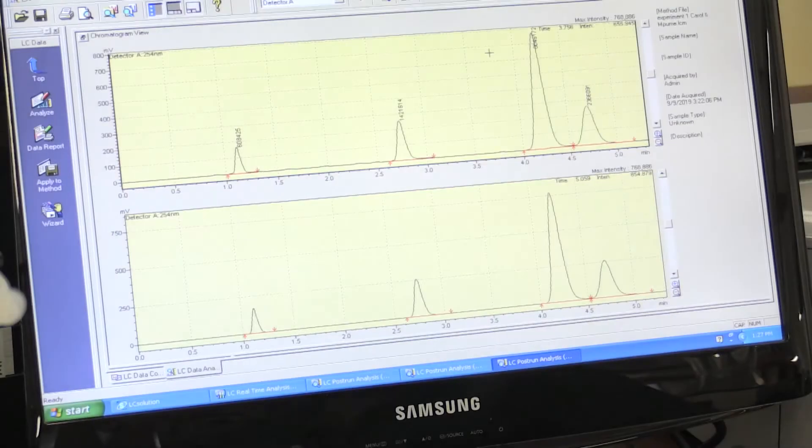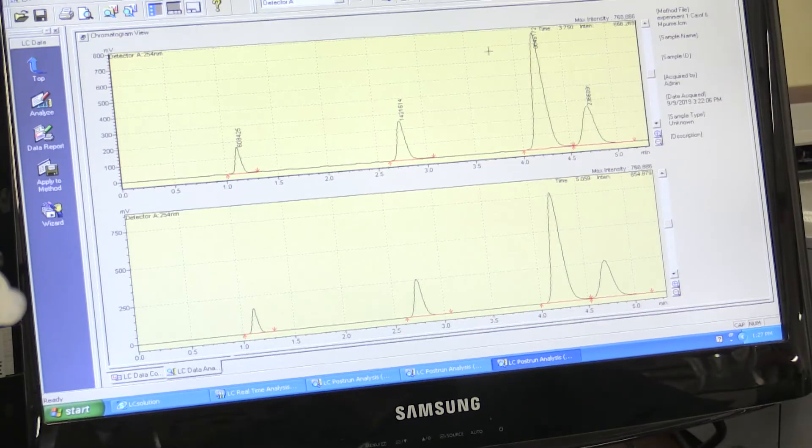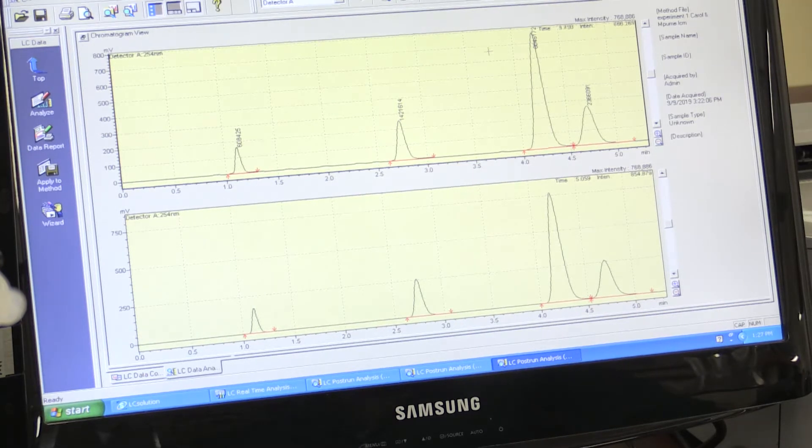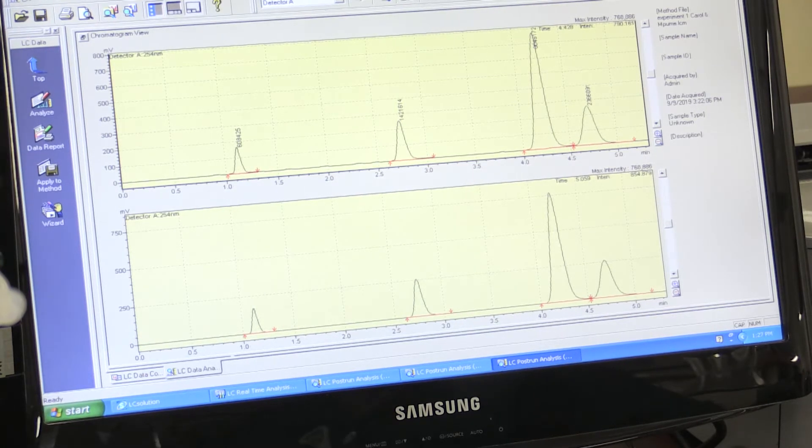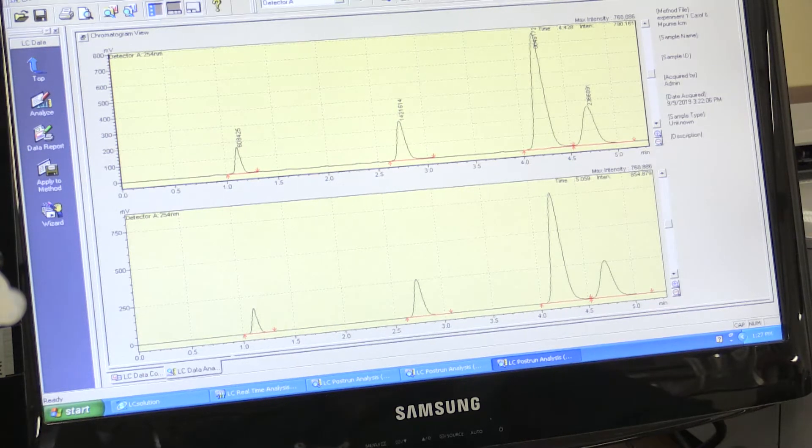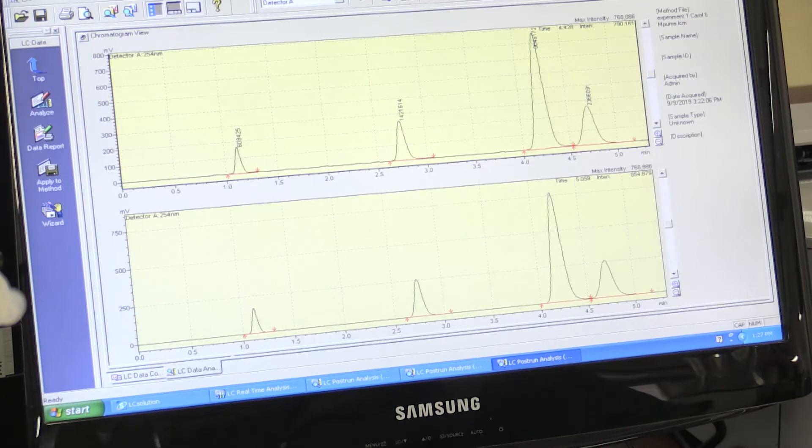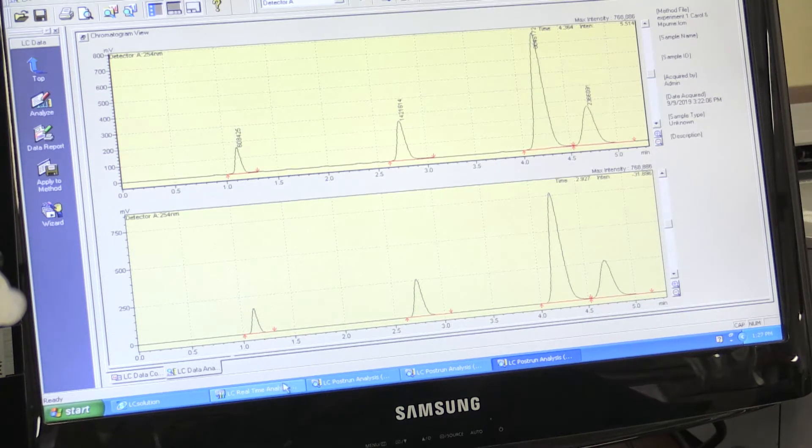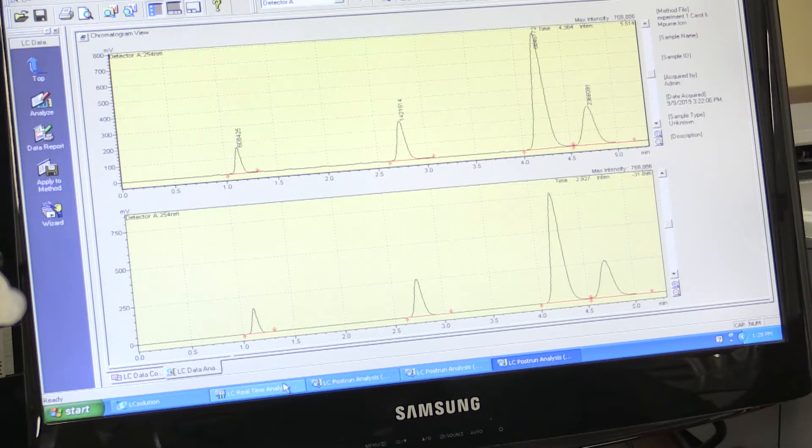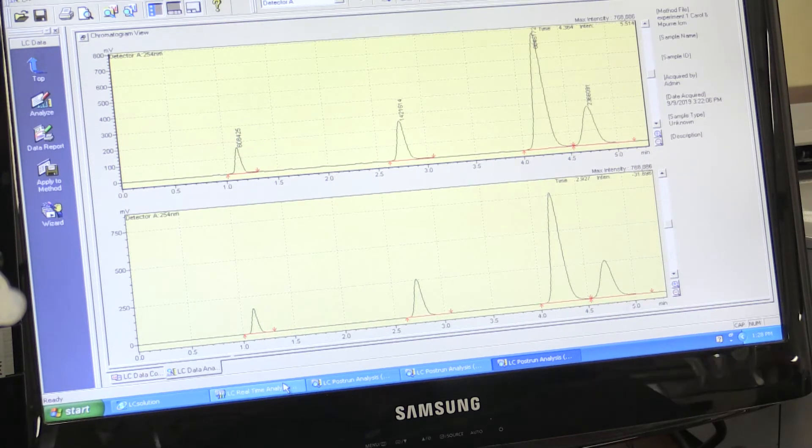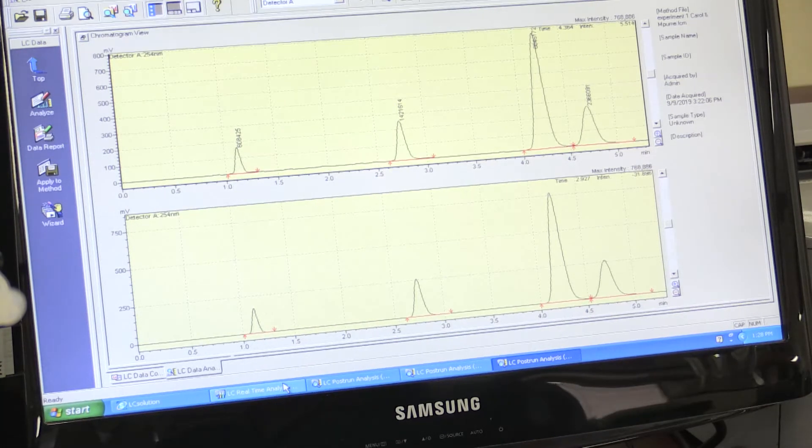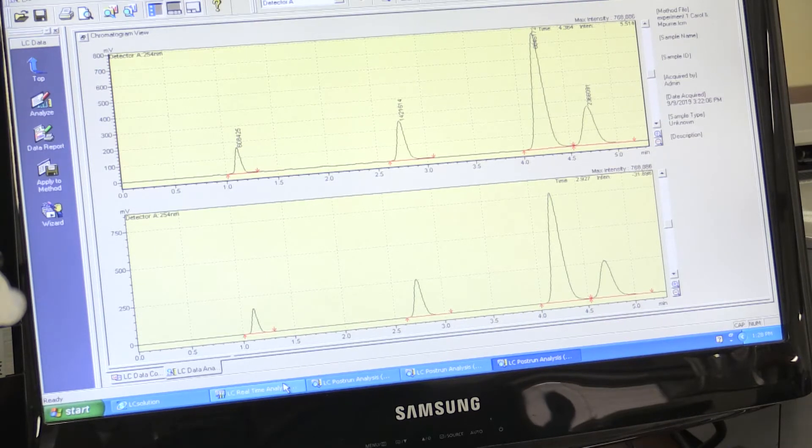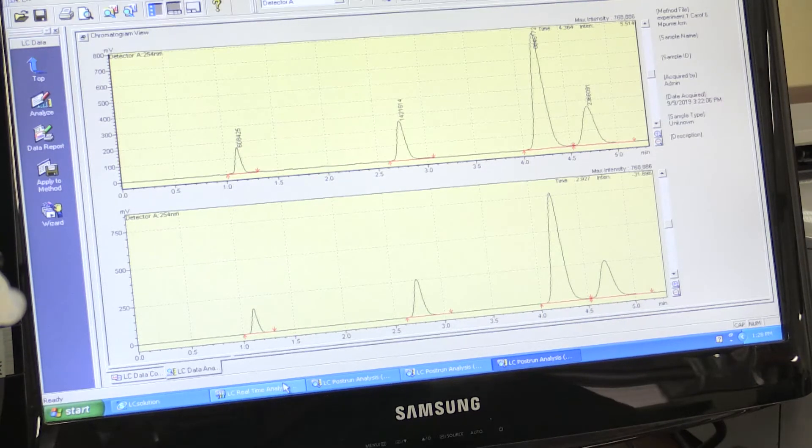We have now optimized the method for the analysis of these four compounds. At this stage, we are now ready to proceed with the next step in the analysis, which is to change the detection wavelength to 280 nanometers as specified by your manual.